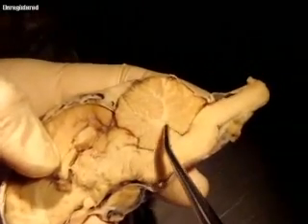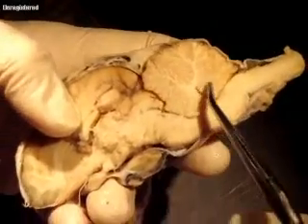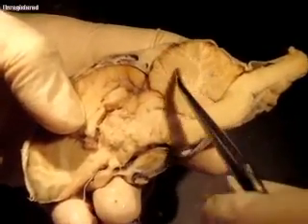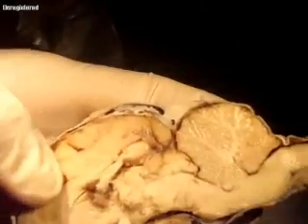Any other questions about the brain? Oh, sorry. Cerebellum. And then this little tree-like thing here is the arbor vitae, or tree of life. By the way, do you see this in the dura? This is kind of neat, because remember we said that the dura mater in the brain has two layers.